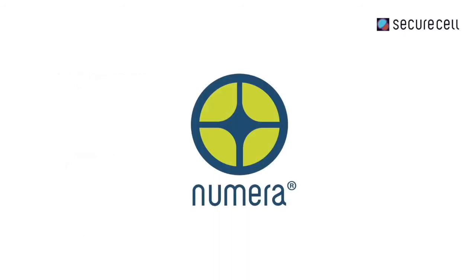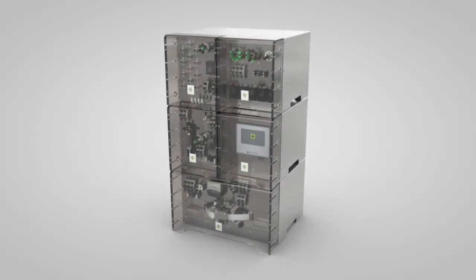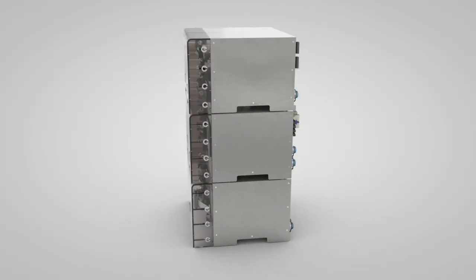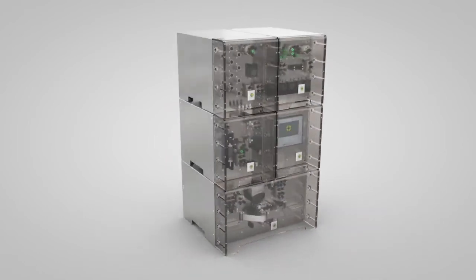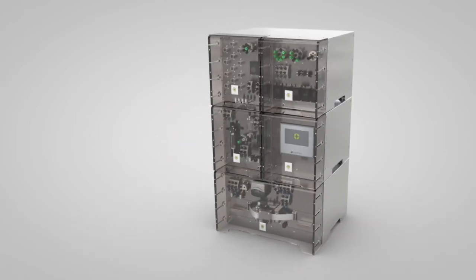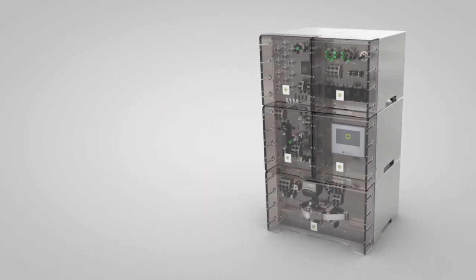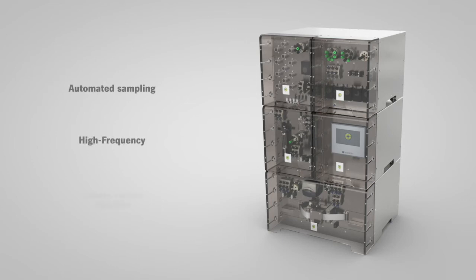With its automated sample-based PAT solution Numera, SecuraCell addresses the shortcomings of manual and partly automated bioprocess development approaches. Numera allows automated high-frequency sampling at the lowest volume possible.